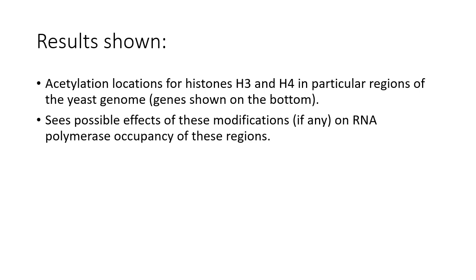So what the results are, we're showing our little tick marks, acetylation for the locations of H3 and H4. Now it's important that those antibodies bind just to the acetylated forms of those histones and not the unacetylated forms. Right? It's amazing that they can be that specific, but that's important. Okay, so there's many antibodies available.